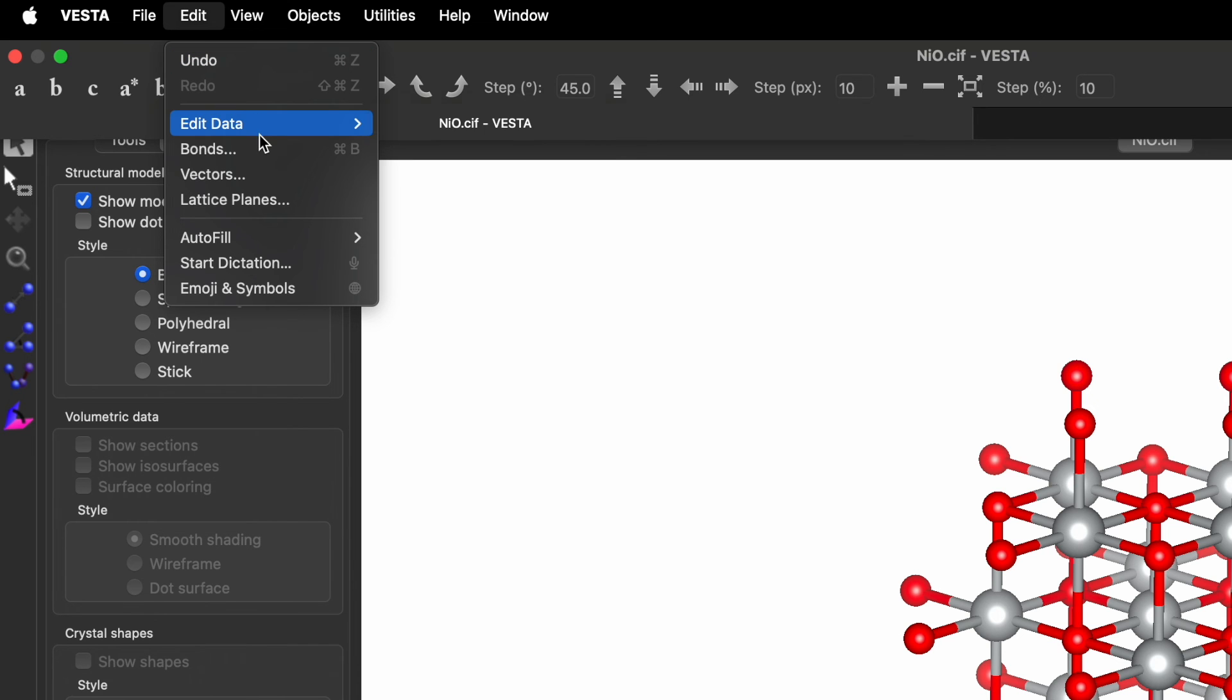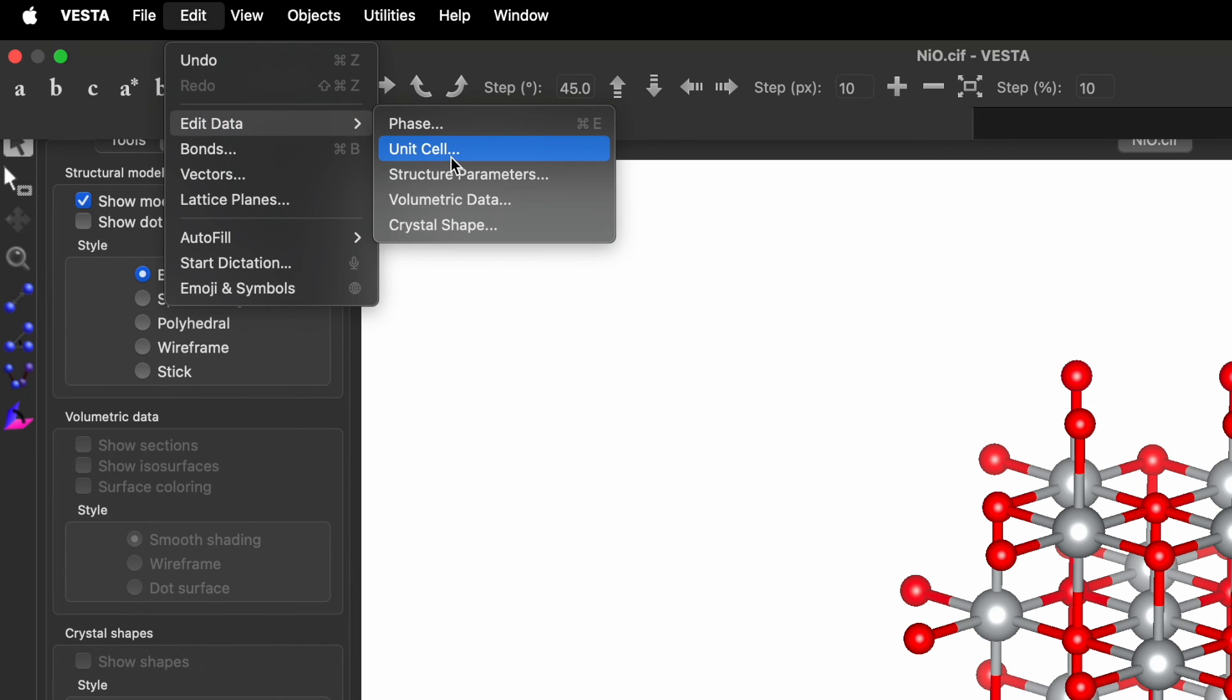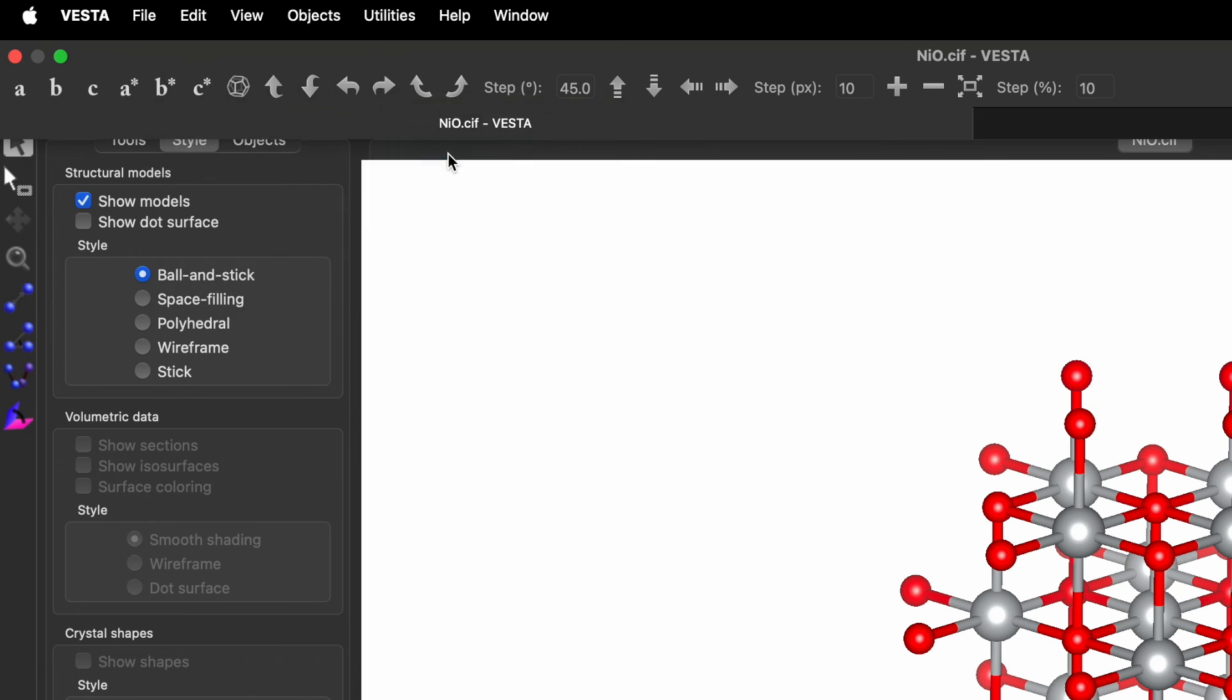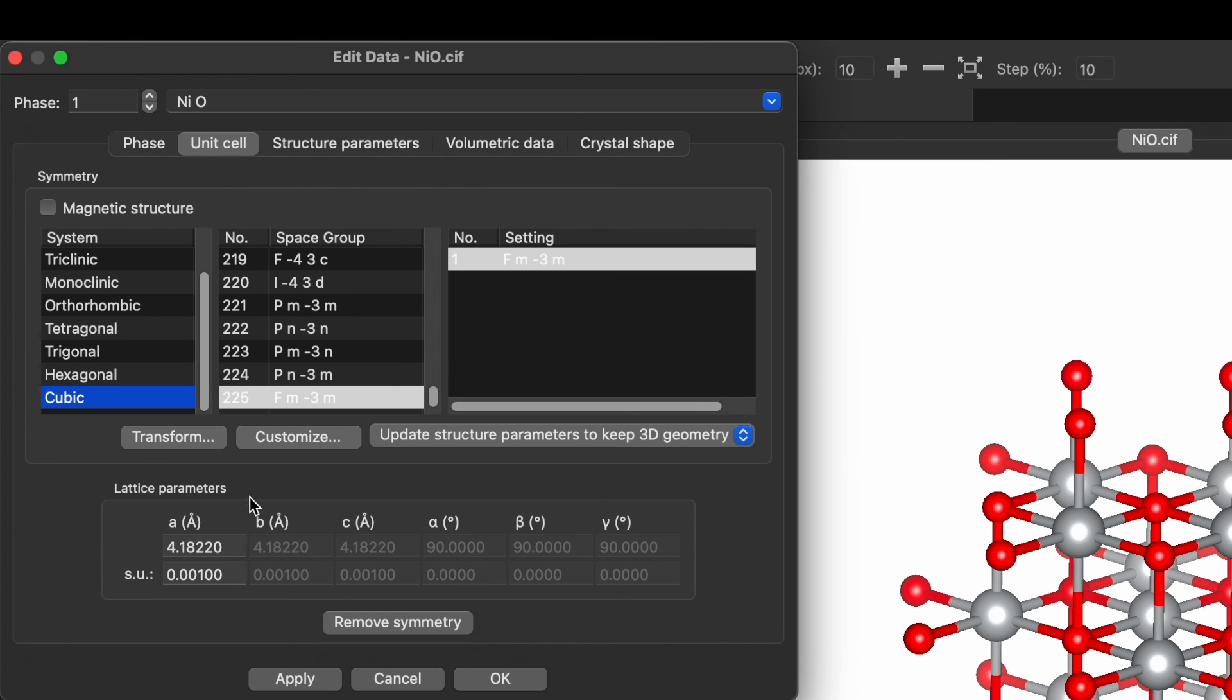So over here you can find the value which is close to 4.18220. Although this is not the exact value. If you want to get an exact value you need to perform Rietveld refinement.